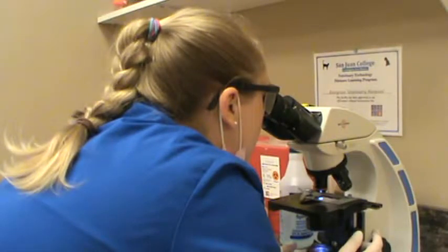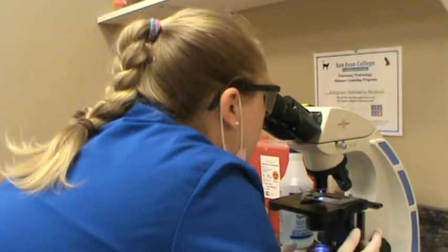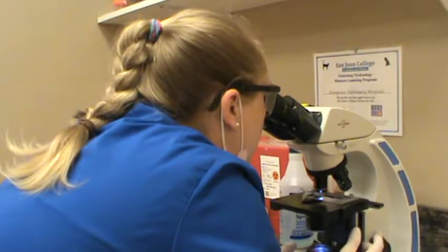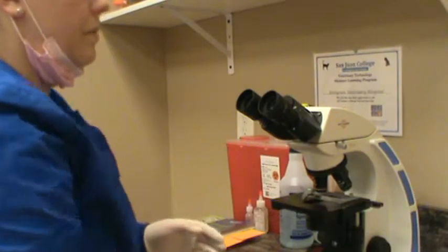Still searching here, haven't found anything yet. This is a feline sample — the kitten has been having some diarrhea and actually had diarrhea in our exam room, so we were able to collect a very fresh sample. I'm focusing as I go, moving slowly in a controlled back-and-forth motion so I can see anything that stands out. I've reached the end and I don't see any ova, so we're going to call this kitty negative for right now.